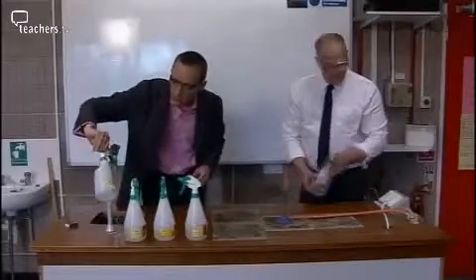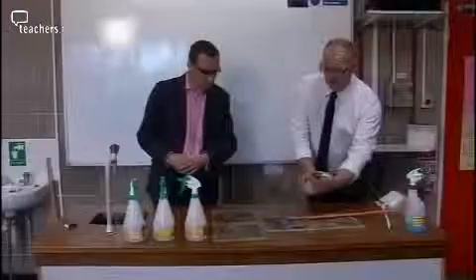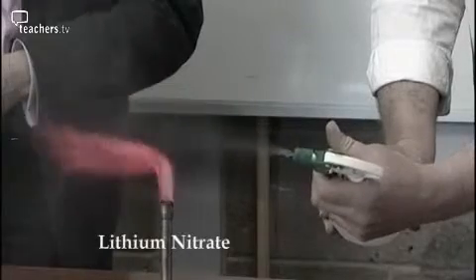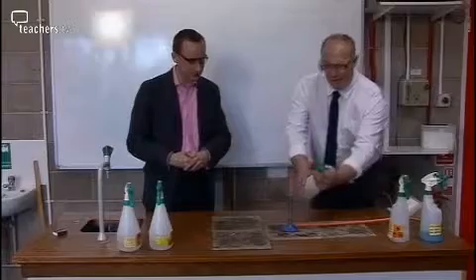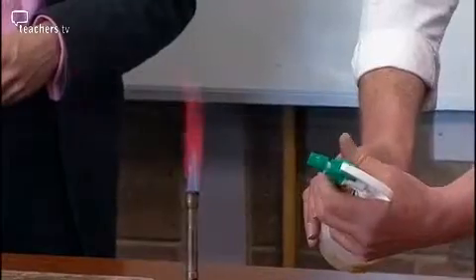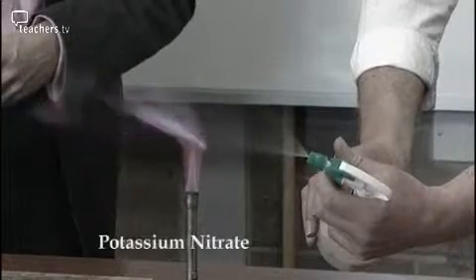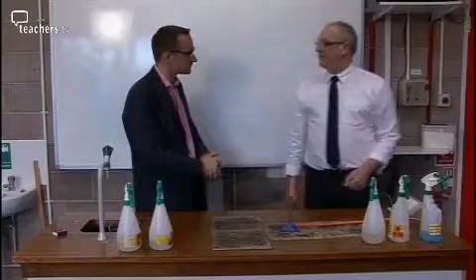We could try another colour. We've got some lithium nitrate, so we'll have a little spray. Lithium is going to give us a red — a lovely red flame. Nice colour. Try potassium. The purple colour — good old faithful, isn't it? You might want to do that with a light stand, but it's just another way of showing it. An excellent view of those colours. Of course it's absolutely crucial to fireworks.